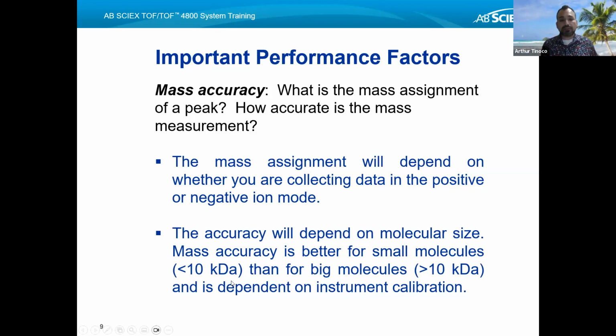Well, it's going to be this mass cutoff, where anything less than 10 kilodalton will be considered small. So that consists of peptides on the smaller end, organic molecules that some of you are working with, perhaps some of the metal compounds that people are working with. And then big molecule would be anything that is greater than 10 kilodalton. So what would fall in line with something that's a big molecule? Well, in this context, bigger sized peptides, proteins for sure.